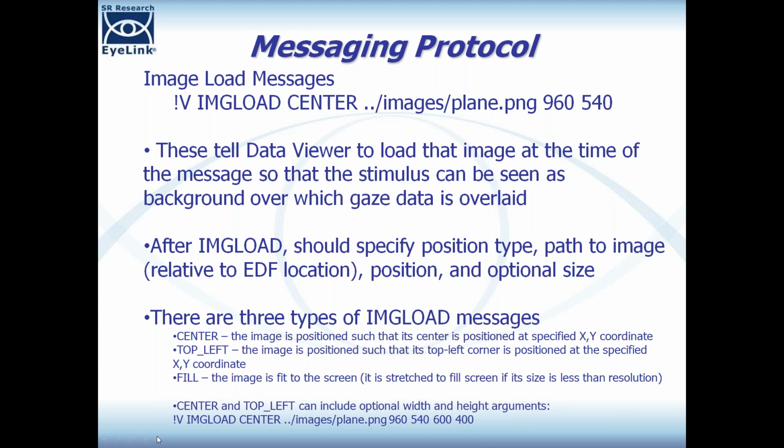So you can use a center coordinate scheme, or if you instead say top left here, then instead of specifying where the center of the image would go, you would specify where the top left corner of the image will be positioned in the trial view window of Data Viewer. And then the third way is you can specify fill. If you put fill here, then it will fit the image to the screen.